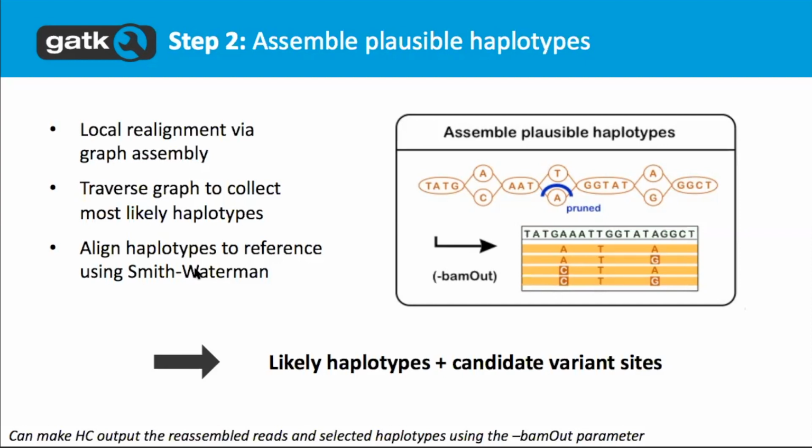Because beyond a certain length, which is variable depending on factors, you're not going to be able to identify those indels very precisely. In some cases, you might not see them at all. And so the mapping information that BWA gives us is great, but the alignment information not so great, because it's doing things only read per read.